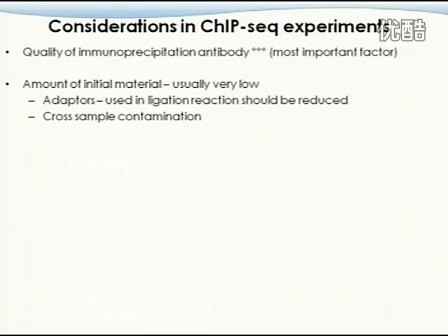And I think if you recall the two papers published in Nature about enhancer identification, the experiment doesn't sound that difficult, right? They did ChIP-seq, and then after that, they identified information out of it. But that is a really difficult experiment to do.